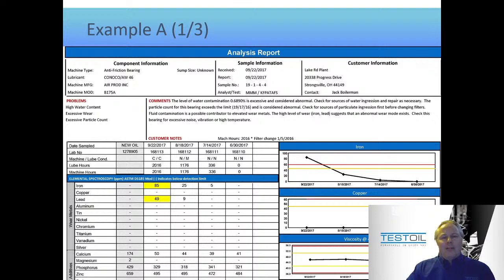And they say, I've had 3 reports in a row and you've commented the same way all 3 times. And honestly speaking, I kind of like that complaint, because when somebody gives me a complaint like that, I can just retort, you keep not fixing it, right? If you want a different comment on a report, something has to change.